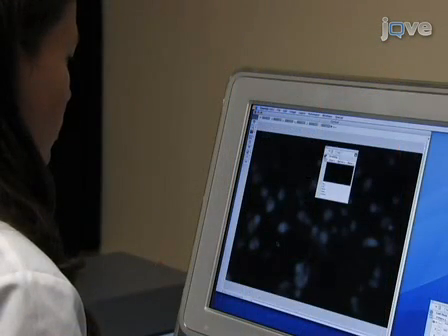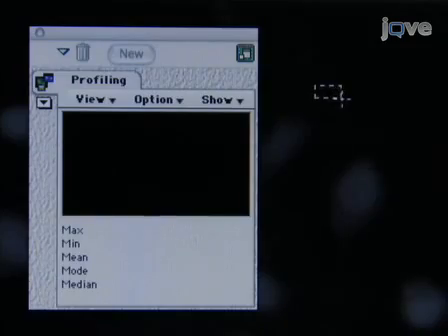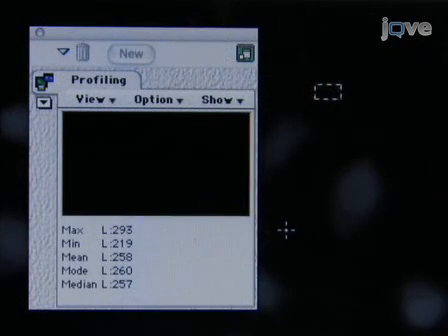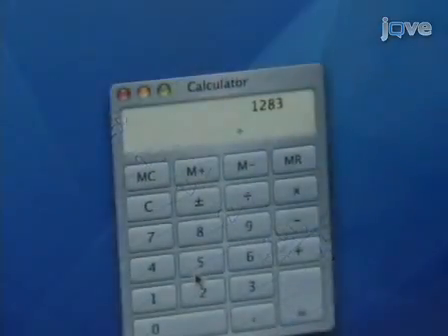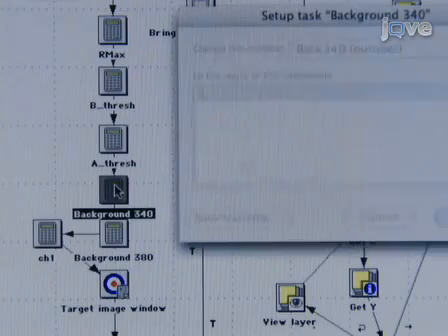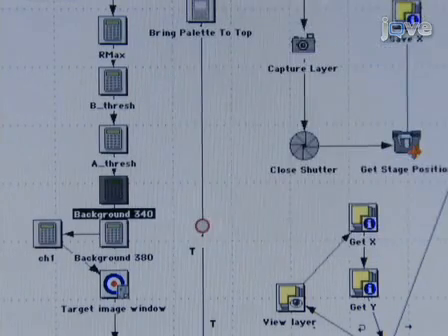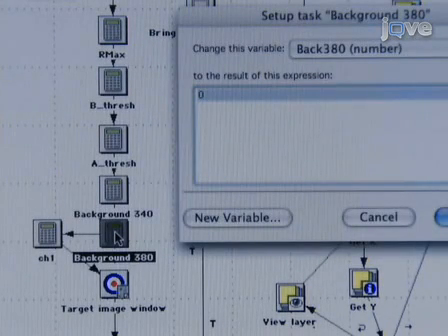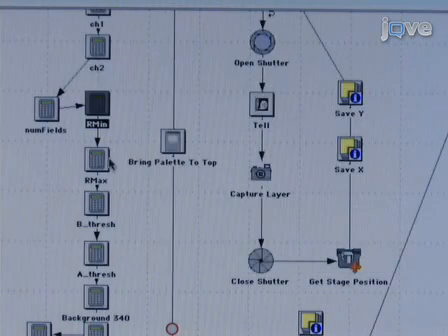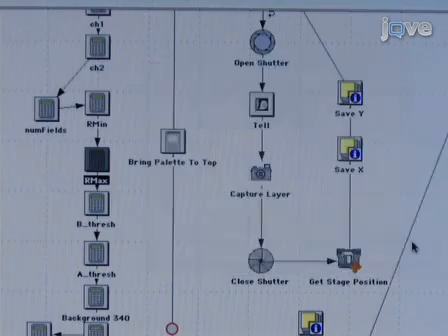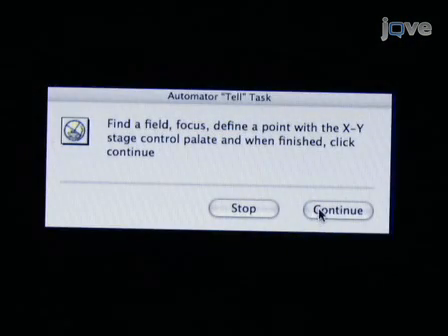Collect an image at each wavelength and use the region of interest tool, or ROI tool, to measure the background intensity in a variety of locations for each wavelength. Calculate the average of the background values and then enter the background values into the appropriate locations in the imaging program. The background intensity will be subtracted from each pixel in the field. Next, enter the maximum and minimum ratio values, or Rmin and Rmax, which were determined previously. Once the Rmin and Rmax are set, choose the fields that you plan to image, and then use the automated stage to record the location of each field of view into the software program. We generally collect 5 fields of view.